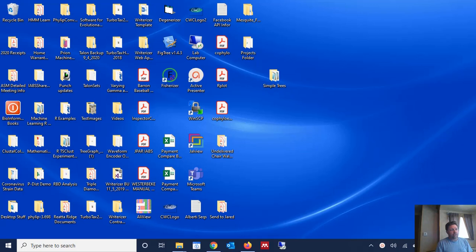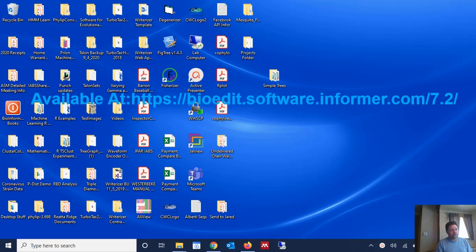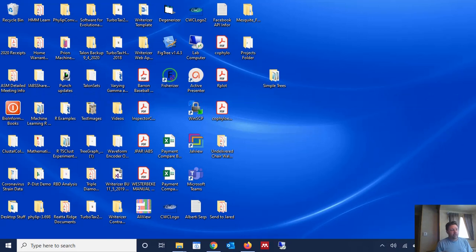And we're going to use a software program called BioEdit that's freely available on the web and I'll post a link in this video of where to access that and where to download it from. But we're going to use BioEdit to create that identity matrix.